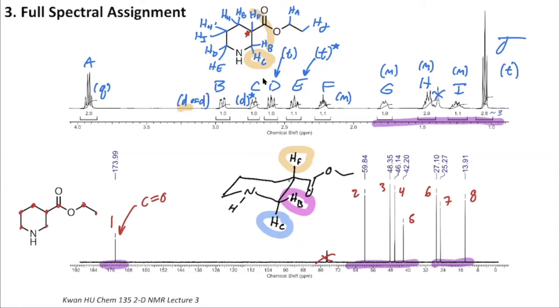And because of our existing stereocenter at that red starred carbon, not only would it make a new stereocenter, it would create a pair of diastereomers. Thus, the term that we use for protons B and C and many of the other protons in this molecule is diastereotopic. We take this to mean if you were to substitute one and the other protons for some other atom or molecule of interest, that you would create a new pair of diastereomers.